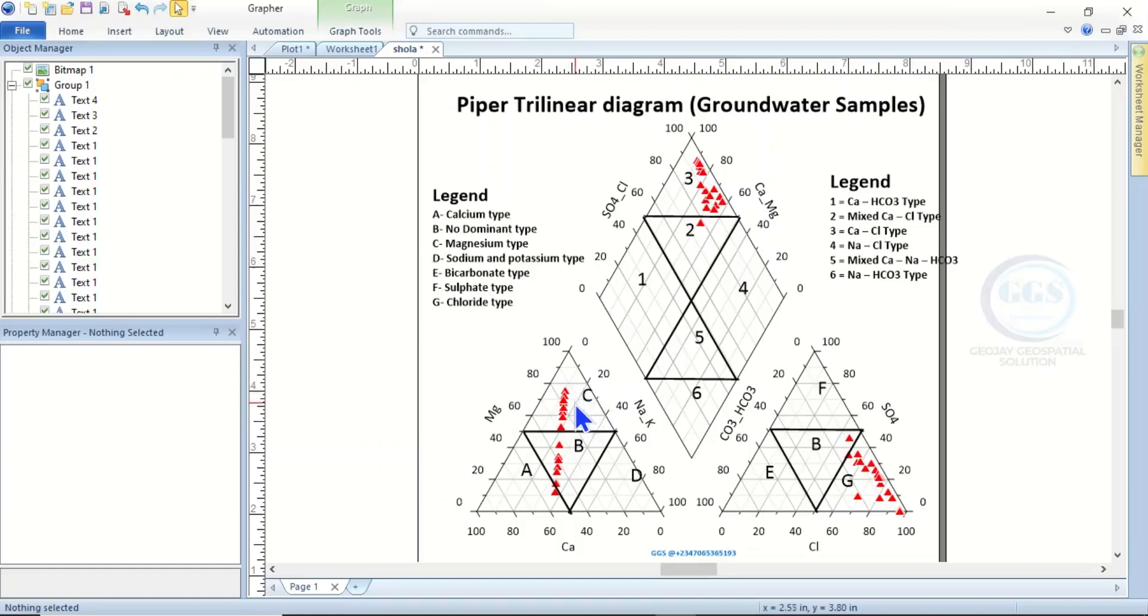Now coming to anions, you can see the anions here. E is bicarbonate type. For example, F is sulfate type. You can see that sulfate is at 100 here and zero here. Likewise, chloride is at 100 at this point and zero at this point.